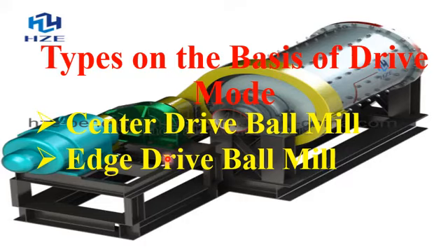So basically, please note that this fifth type of ball mill apparatus, which is known as the drive mode ball mill apparatus, depends on the place where we put the power source for the conversion of the bulk material into a soft or fine material.